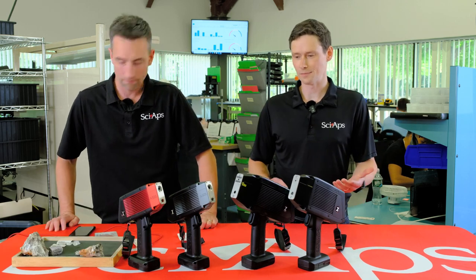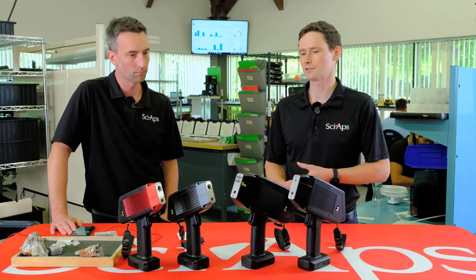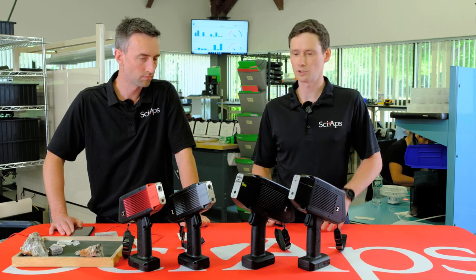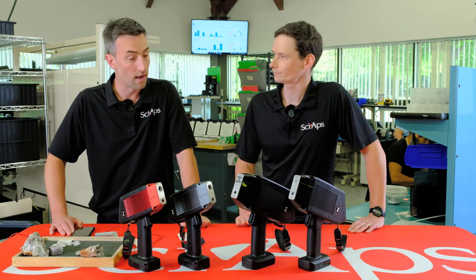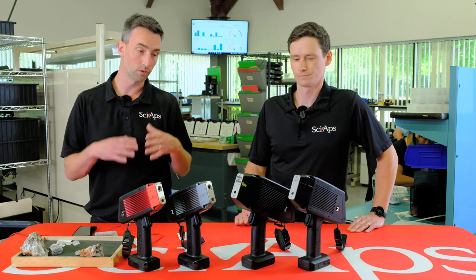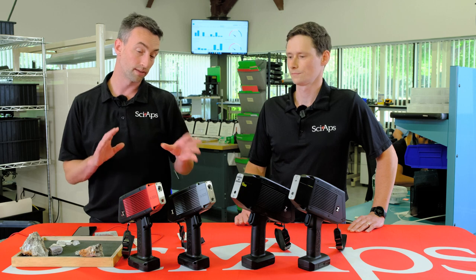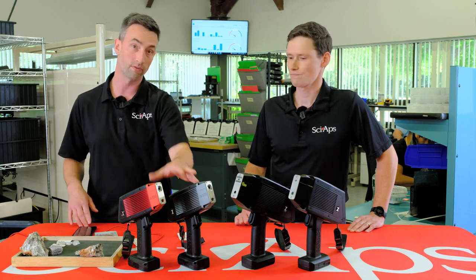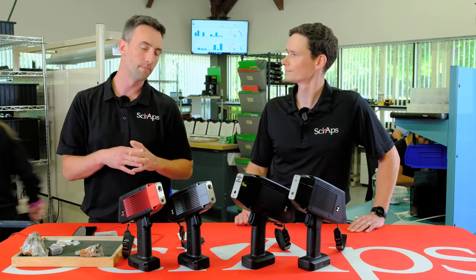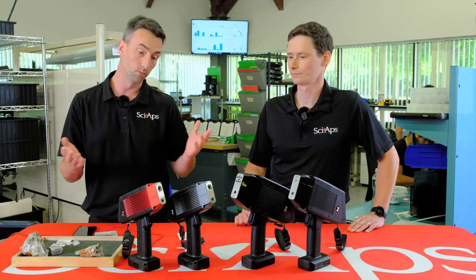So I wanted to start maybe today with the biggest question we get when we talk to customers for the first time. What is the biggest difference between LIBS and XRF, and when would you use one over the other? Yeah, absolutely. So they're similar in that they both do elemental analysis. So you get multi-element geochemistry in the field in real time. The key difference is with XRF you get magnesium and heavier, so you miss those light elements, hydrogen to sodium. But pretty much magnesium through to uranium, you get really good data.